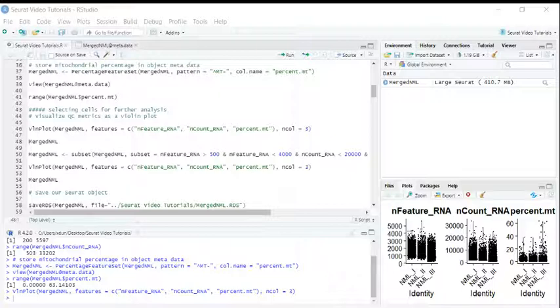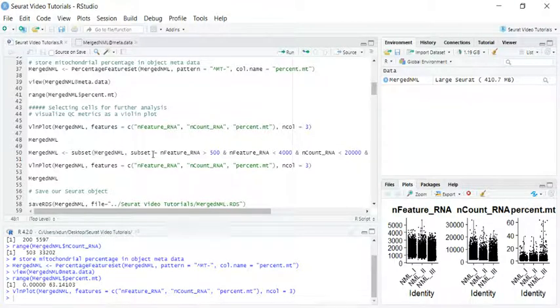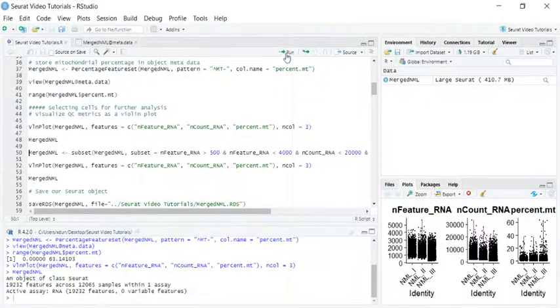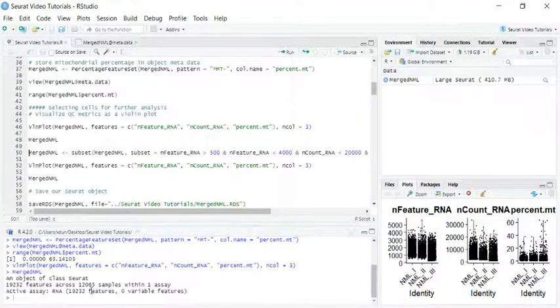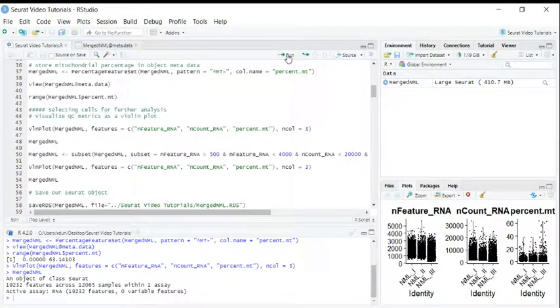We can use these parameters and the subset function to get rid of low-quality cells. Before we run the subset function, we can have a look at the cell numbers in our object. You can see we have 12,065 samples in our object. Let's run the subset function to get rid of low-quality cells.